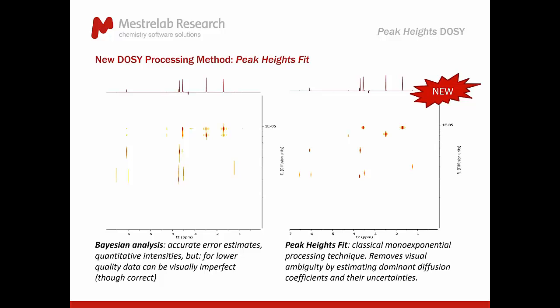Right, so the Bayesian method is really powerful and statistically accurate, but sometimes it's too accurate and too correct, and not everyone likes it. If you have a bad data set, you'll probably see that the plot doesn't look very nice.